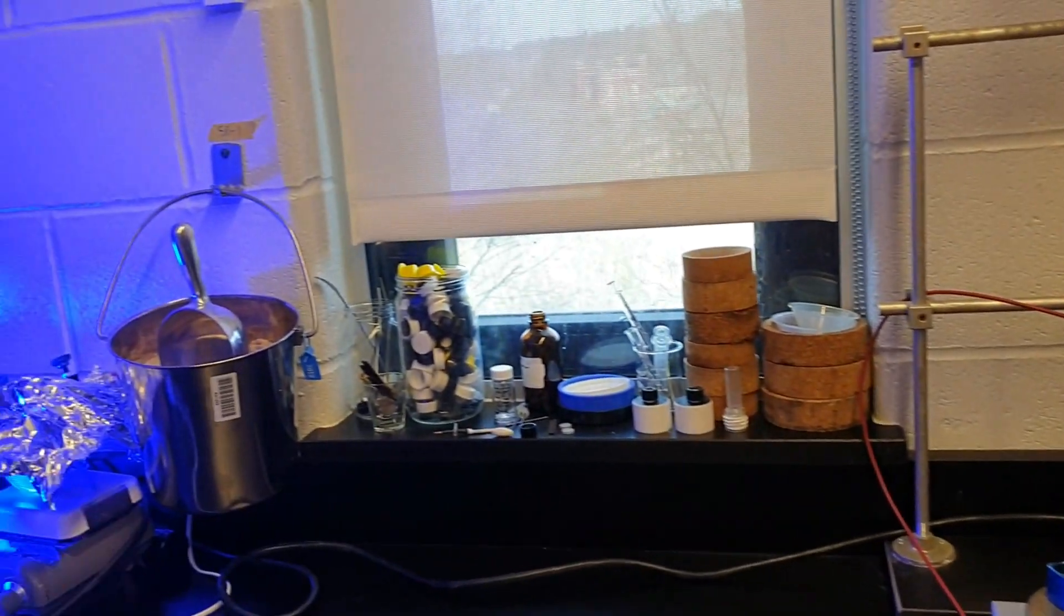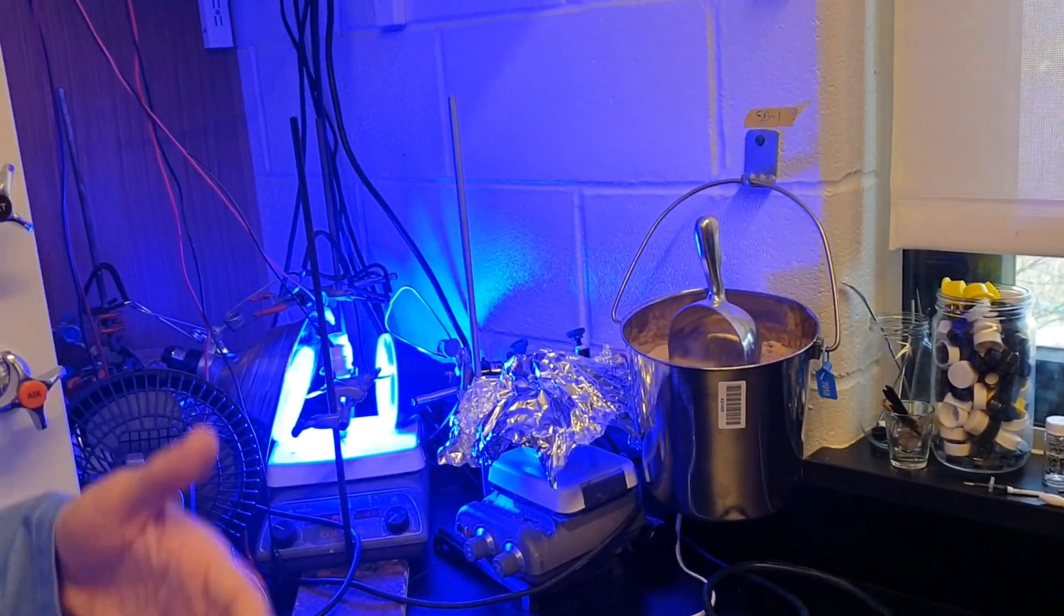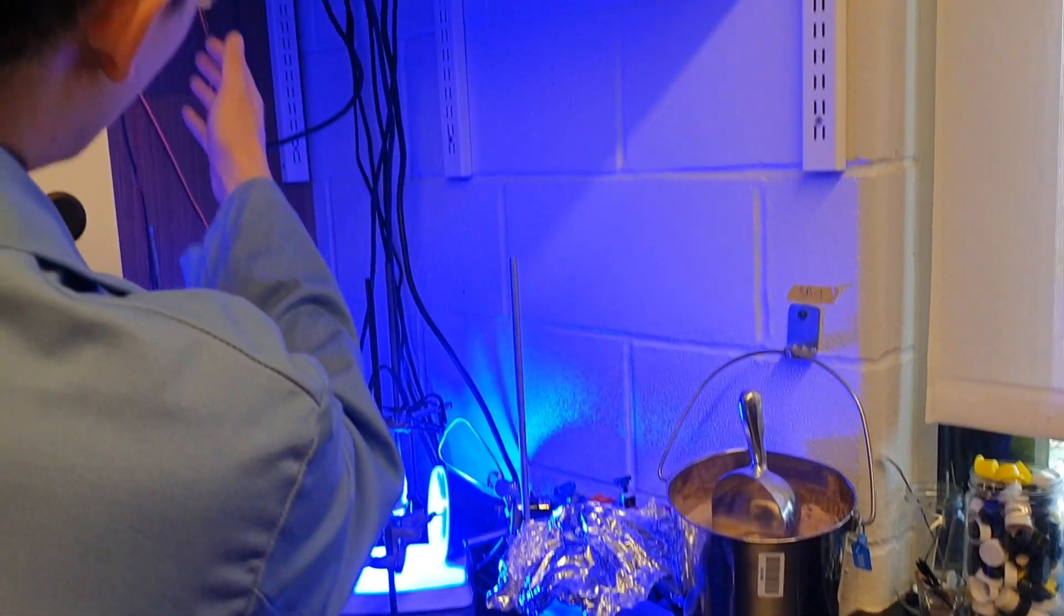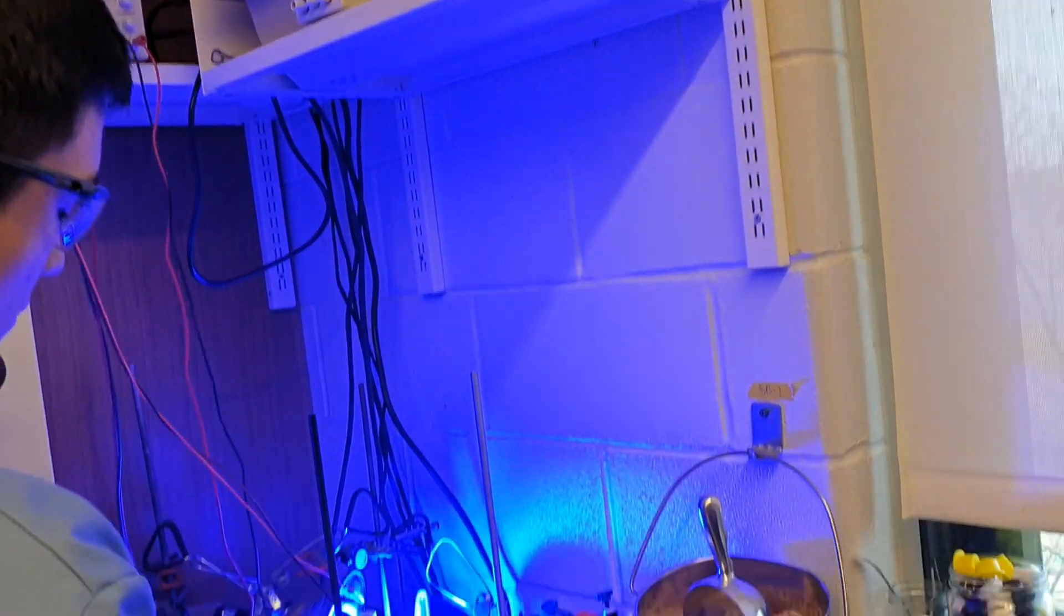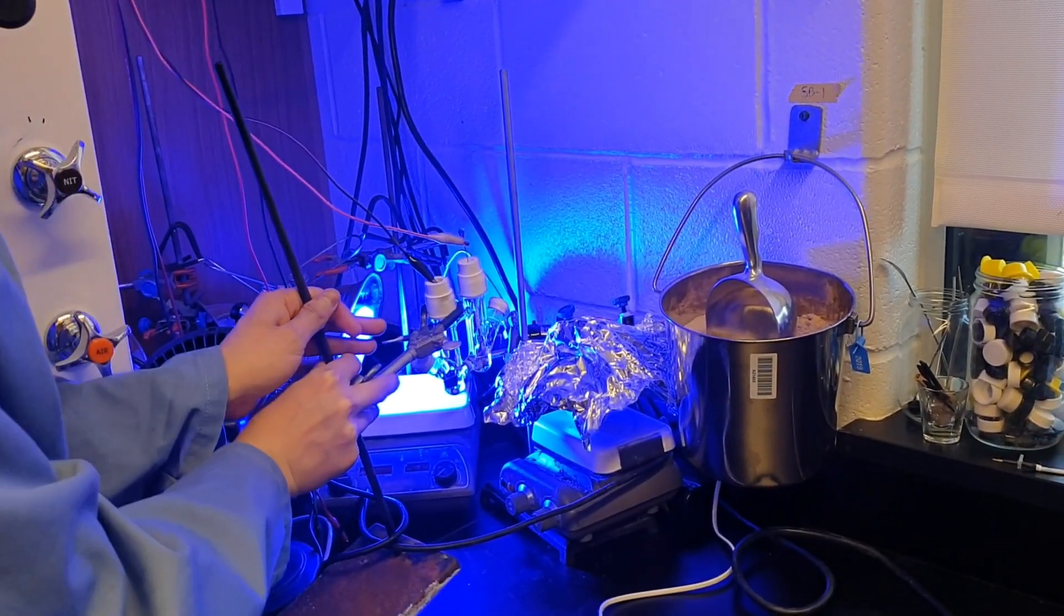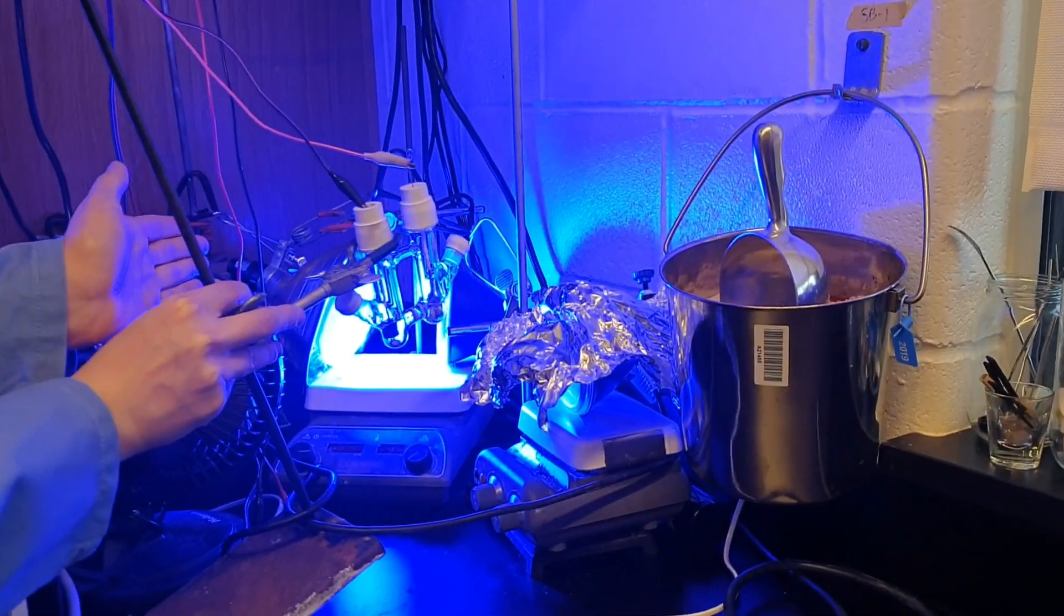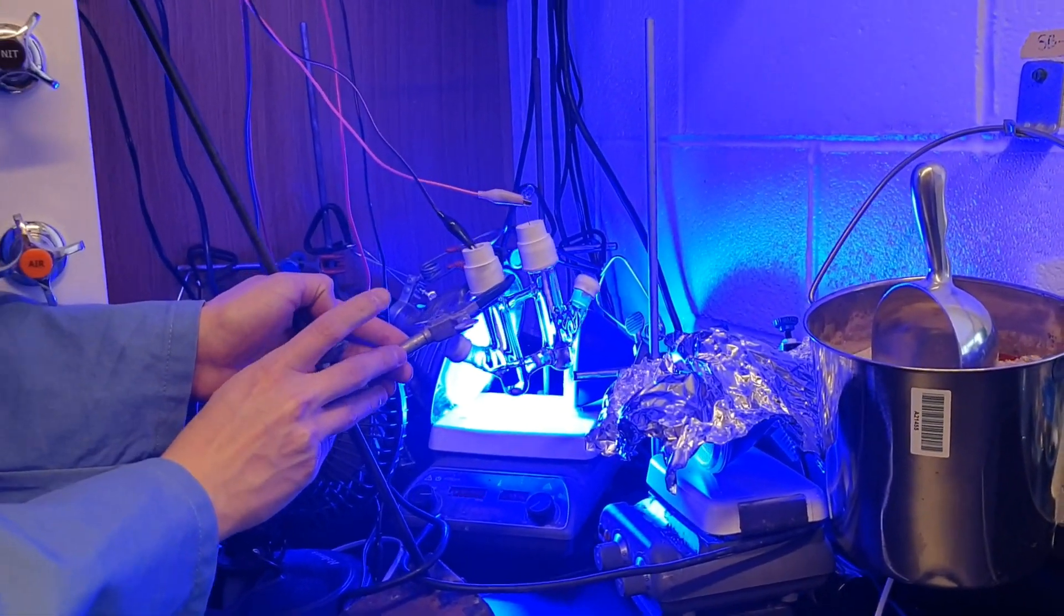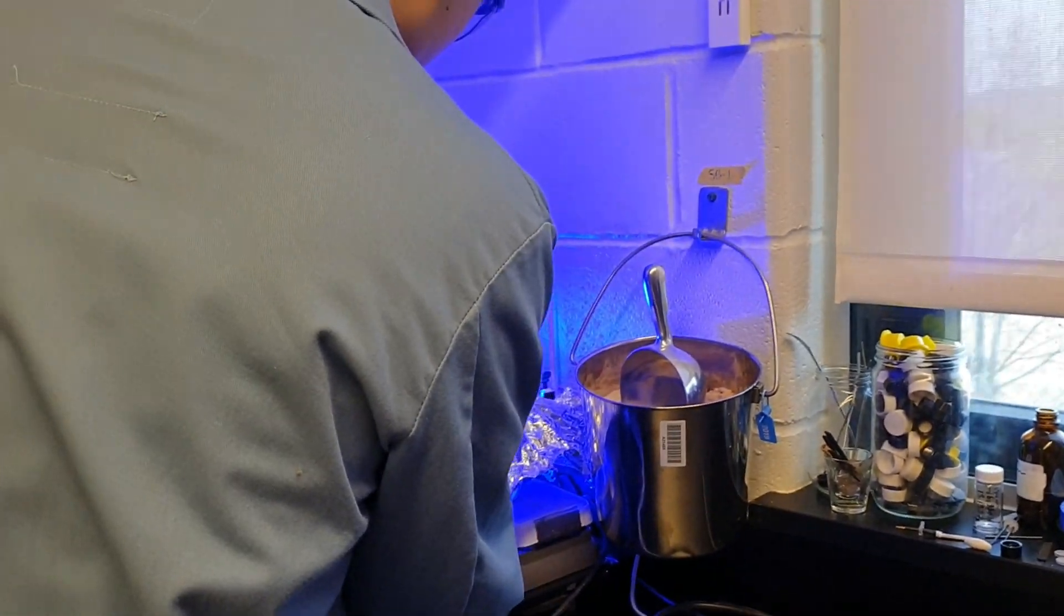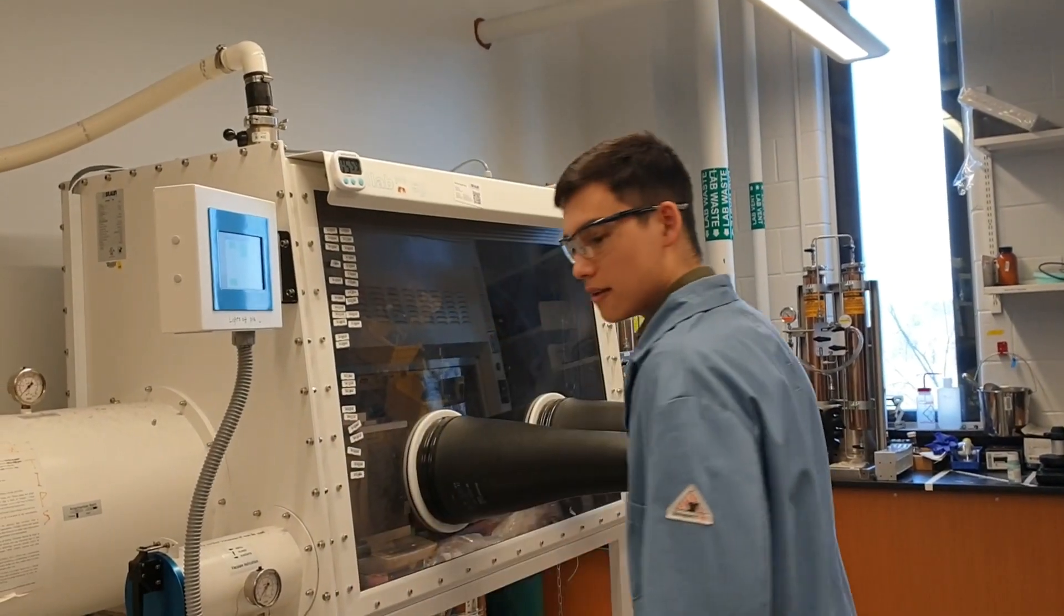A little bit more difficult to setup, we have our photoelectrochemistry setup, consisting of a divided cell and two blue lights for the photochemistry part and the photoelectrochemistry.